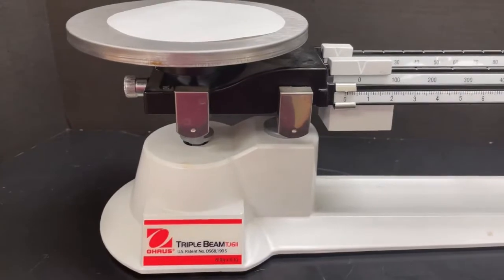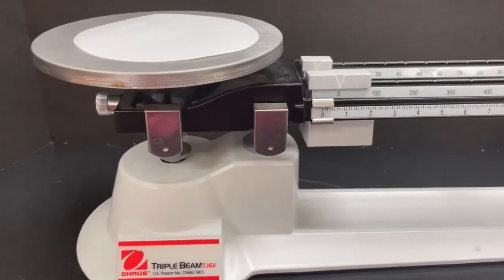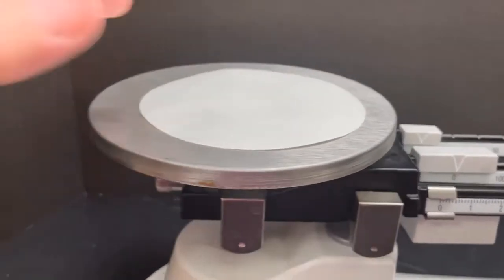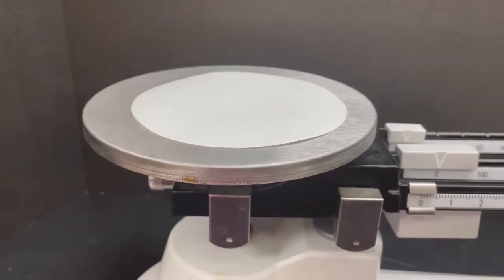This video is about how to use the triple beam balance. First of all, we put a piece of filter paper on the top to protect the tray.